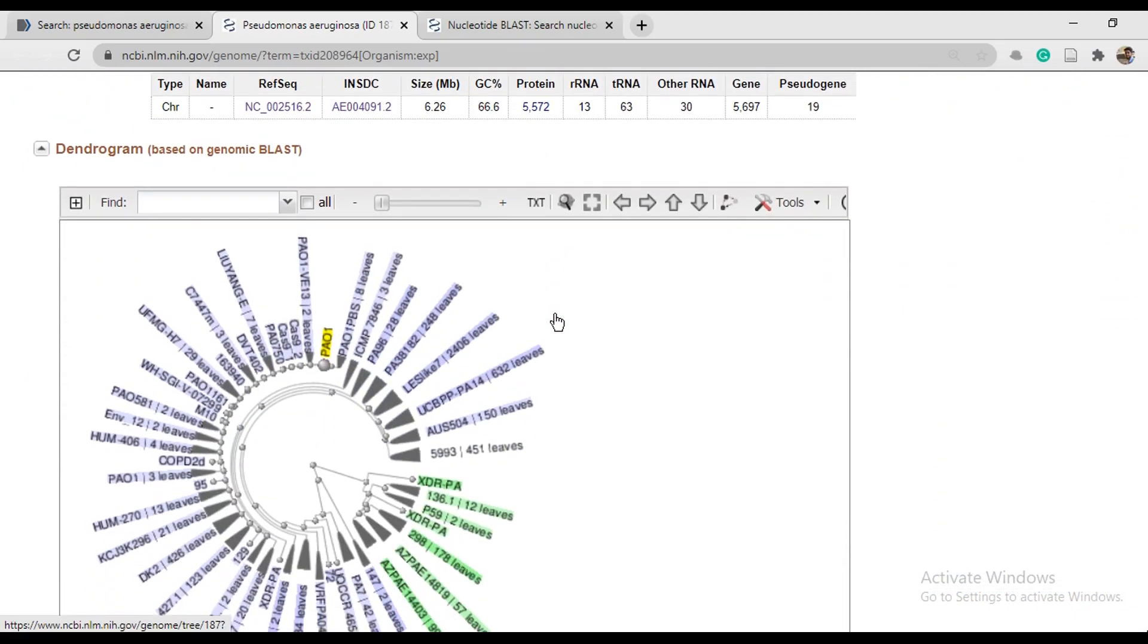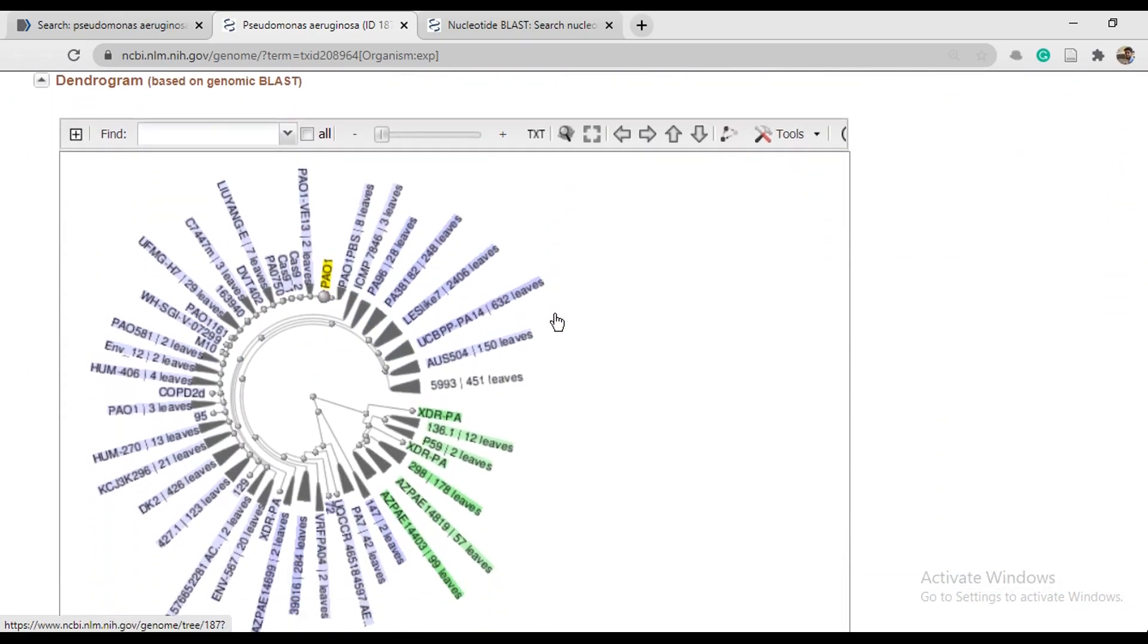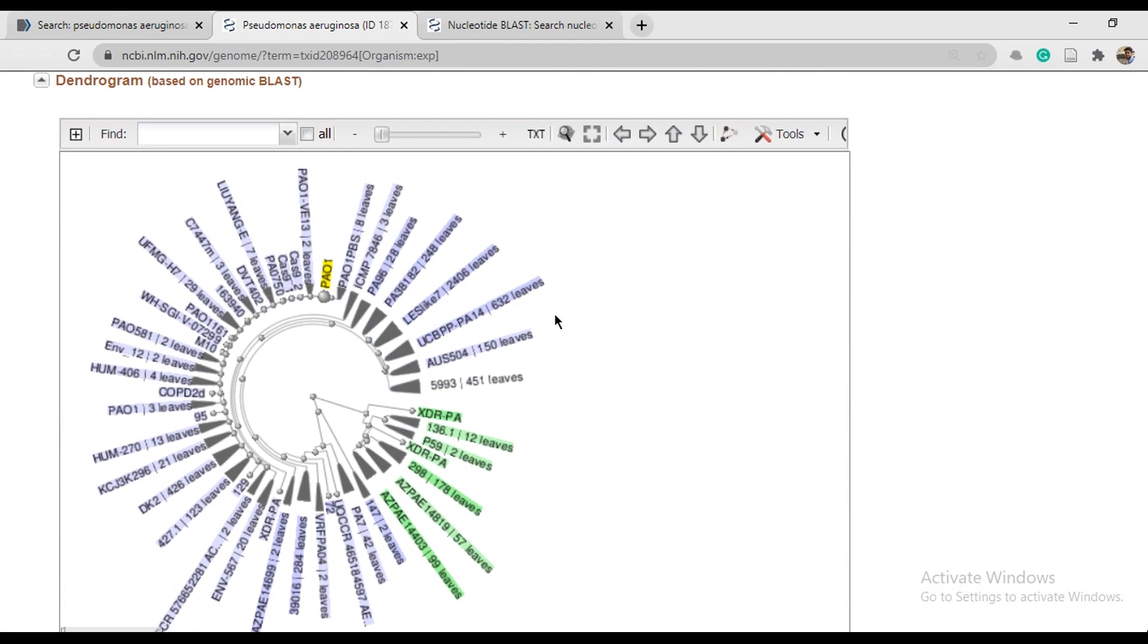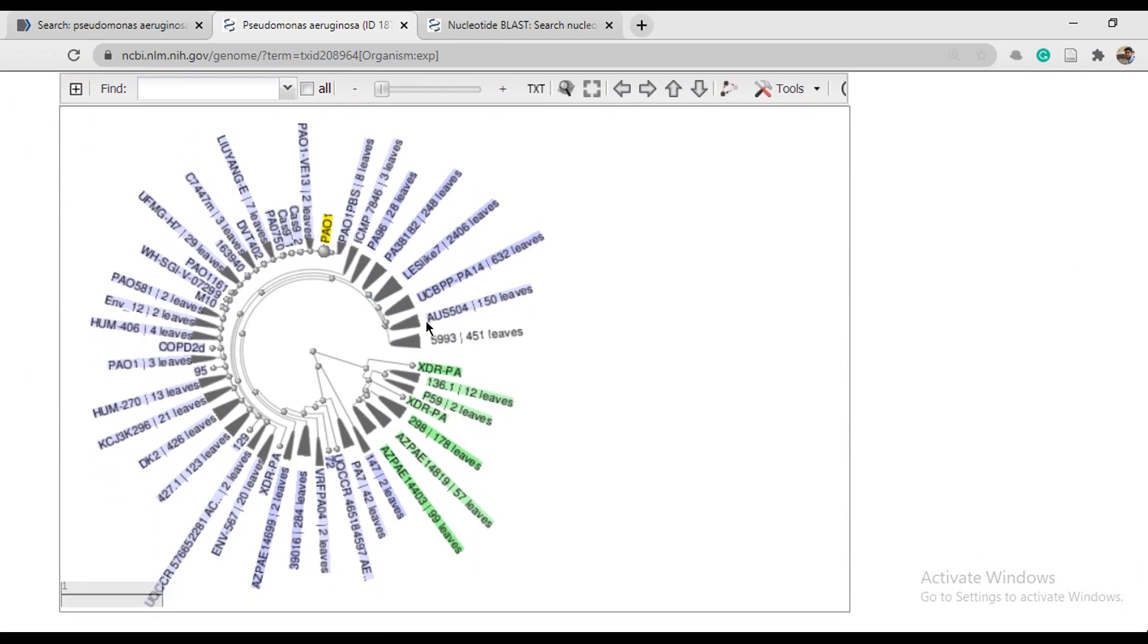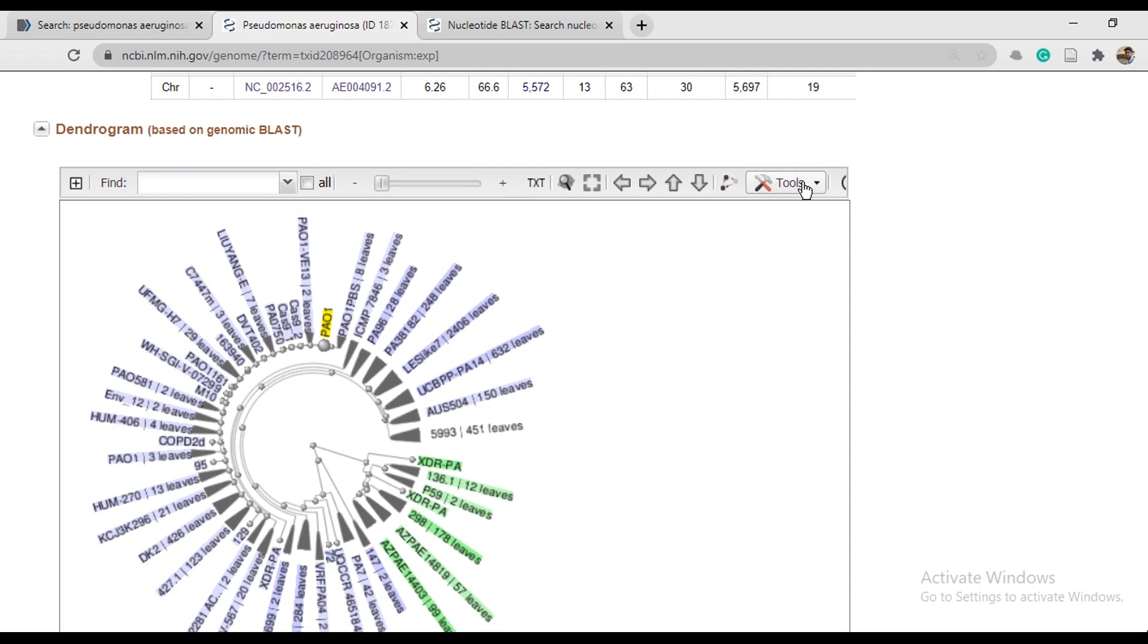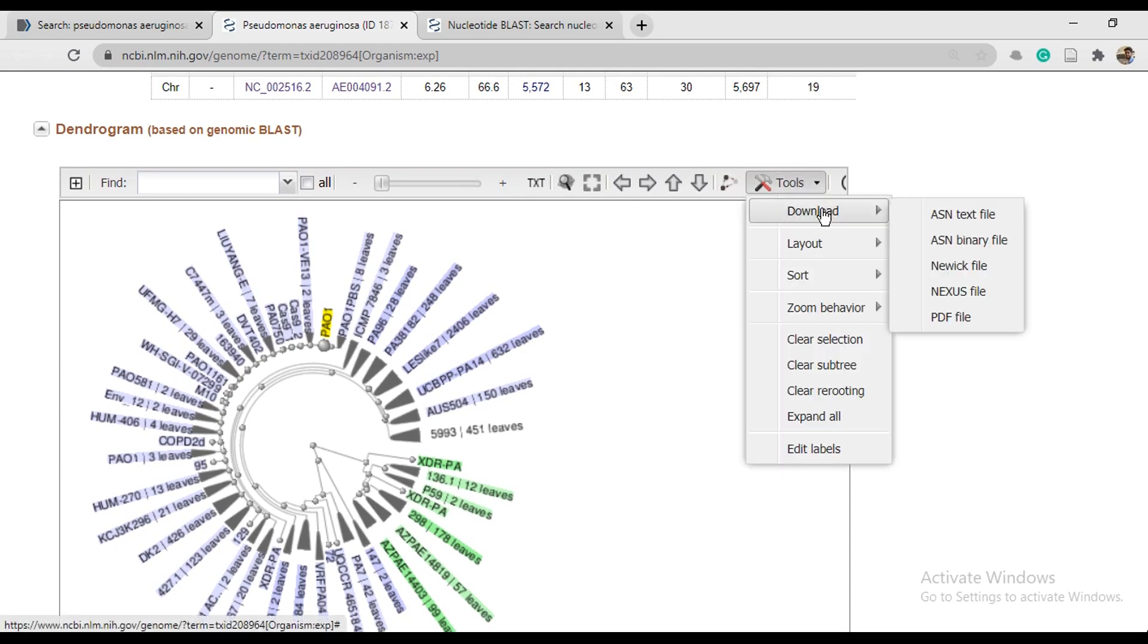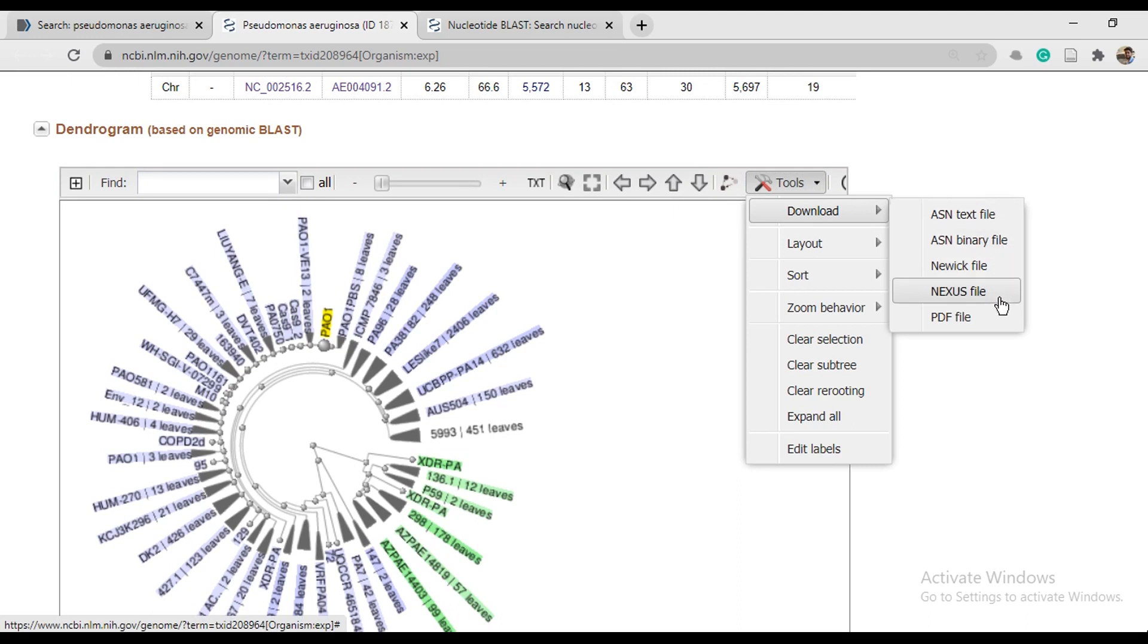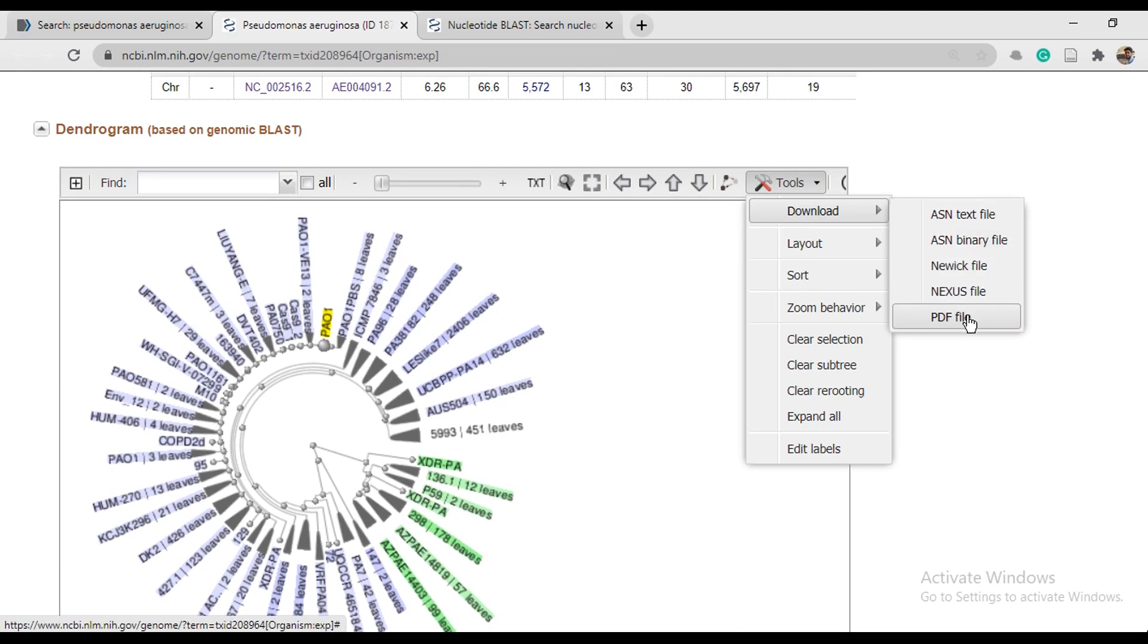In Entrez Genome, you have dendrogram of Pseudomonas aeruginosa genome. You can download this from here. You can get a text file, binary file, Newick file, PDF, or any one.